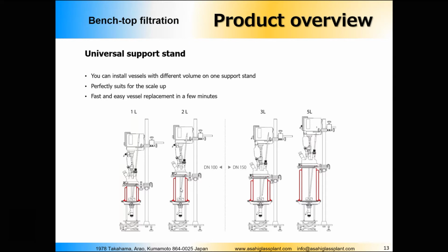But what is also important to mention is that you can easily and very quickly change the vessels from one to another. This is something that I usually actually show on the video, so that's the moment when I switch to the video.